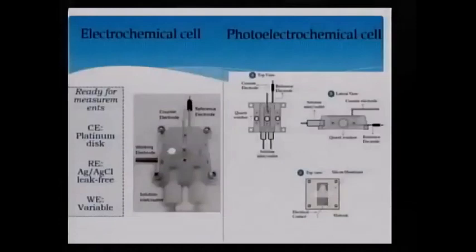So this is the cell. I will skip it quickly, but this is the cell that Eduardo has developed for conventional electrochemical experiments. And now he's developing a similar cell, but with a quartz window to be able to shine light on the electrode and to perform experiments in the dark and with solar light.